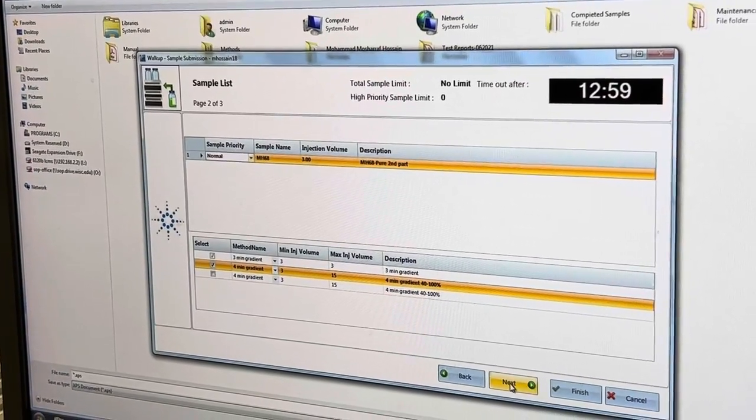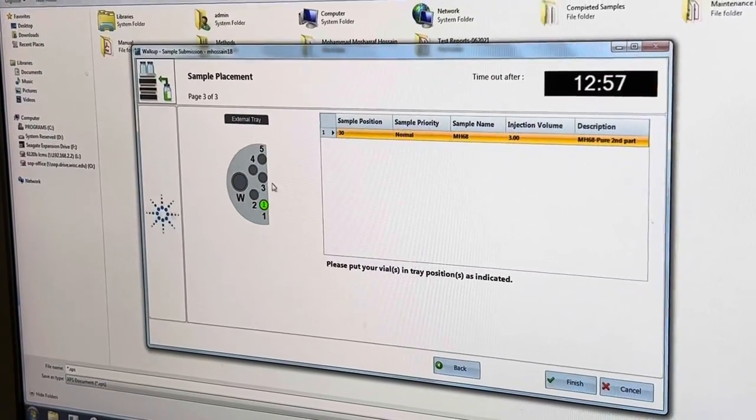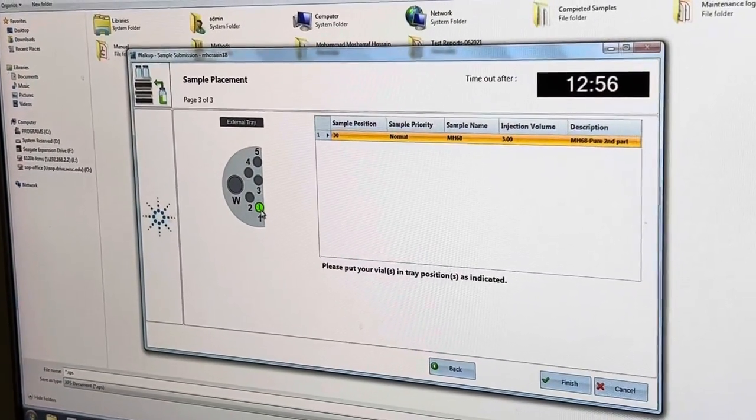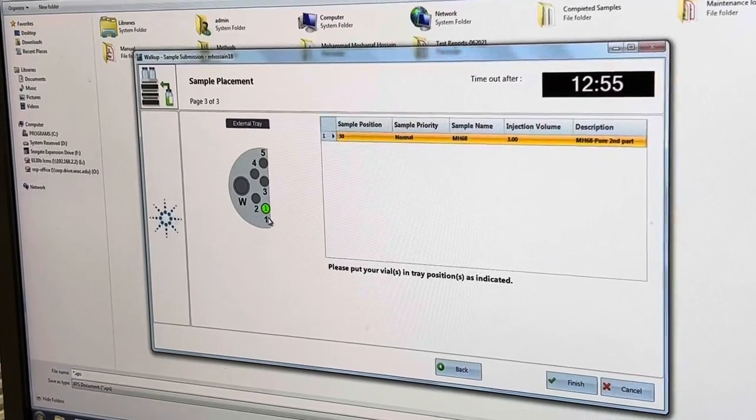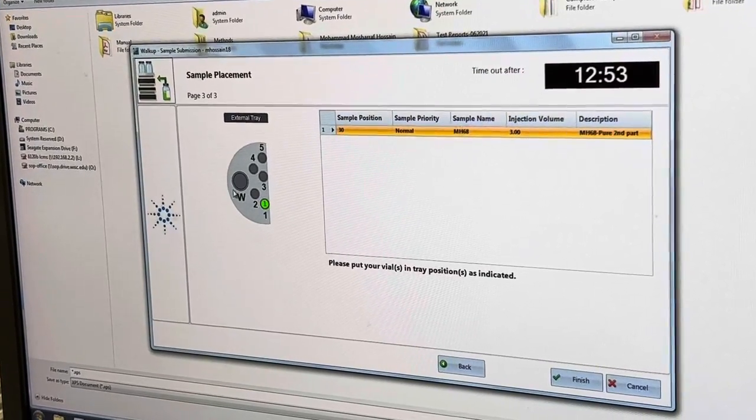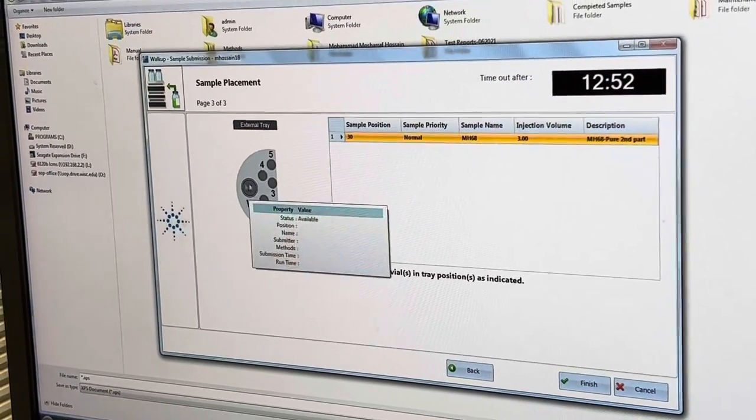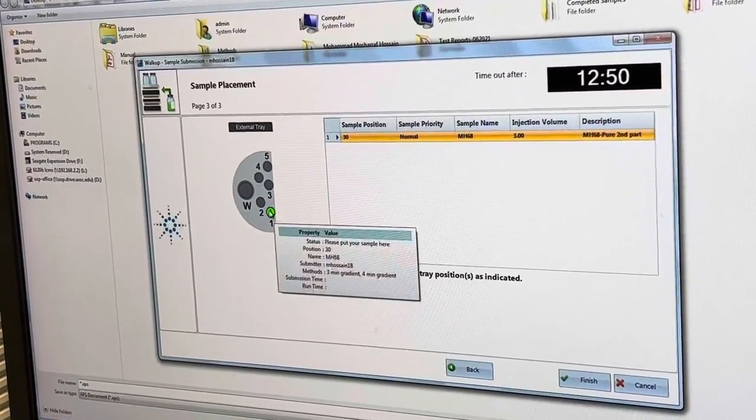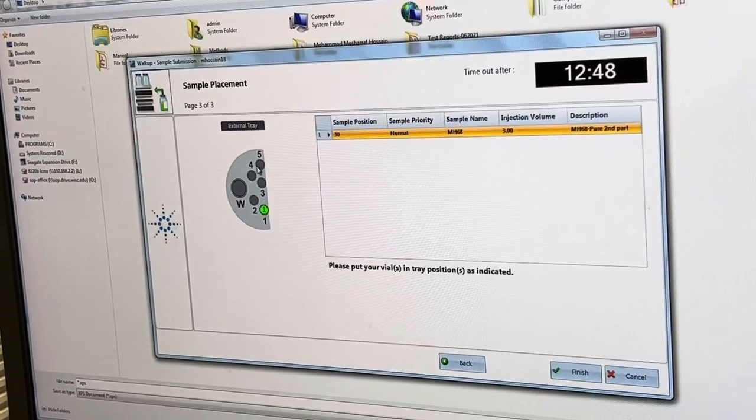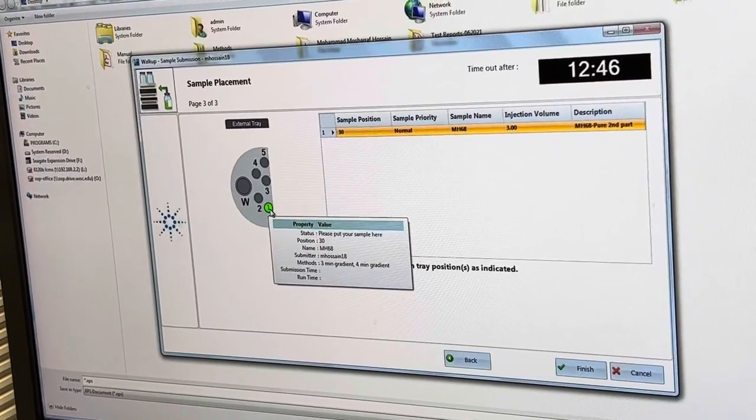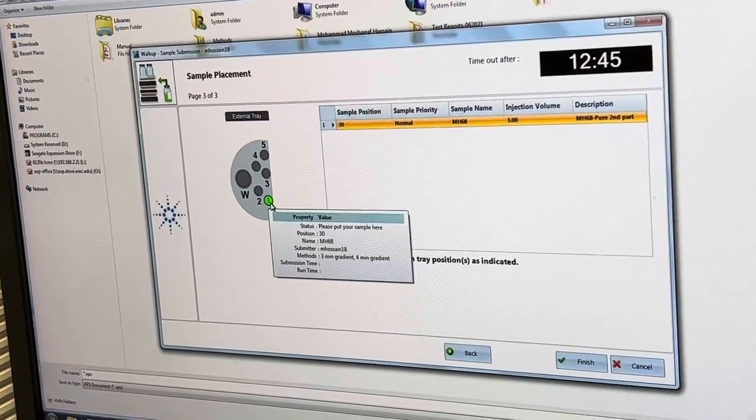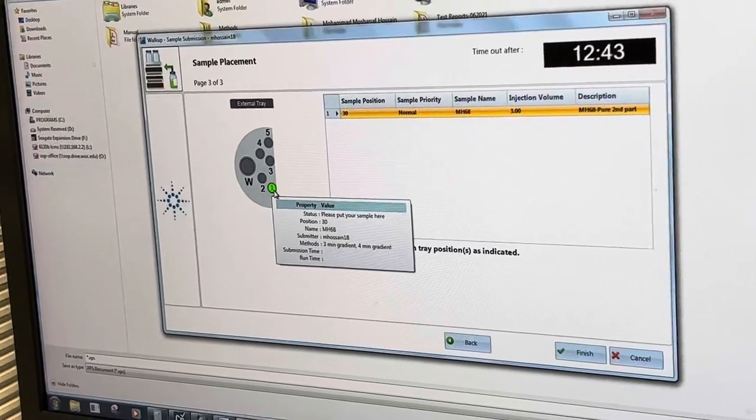Click next, then it will show you where to put your sample. See, one, two, three, four, five, not in this bigger one, remember. So one, two, three, four, five and the one is greener, okay.